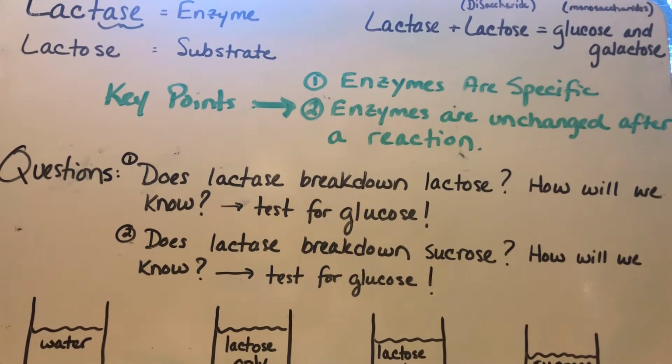Hi everyone. We're going to go over the background information needed to complete your lactase enzyme activity. And once I go over that information, I'm going to actually walk through the lab with you. You can play and pause as needed so that you can write down the data in your student answer sheet and complete the analysis section.